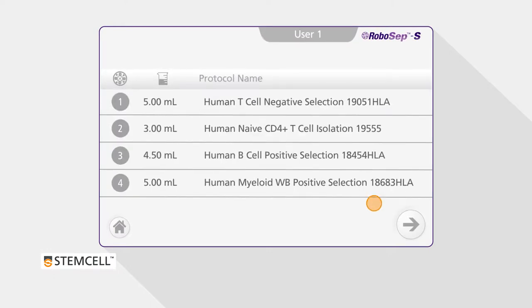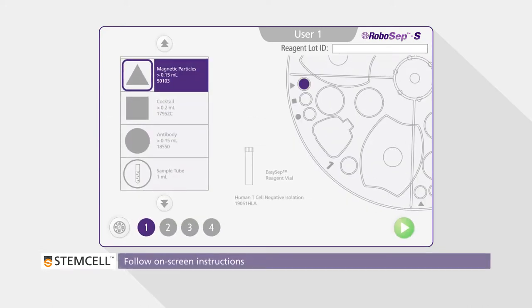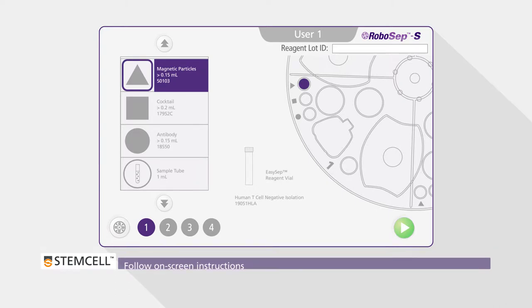After having selected the protocols for each quadrant, you are ready to load the samples and reagents into the carousel. The screen will show an image of the carousel. The on-screen instructions will help guide you through the loading process.